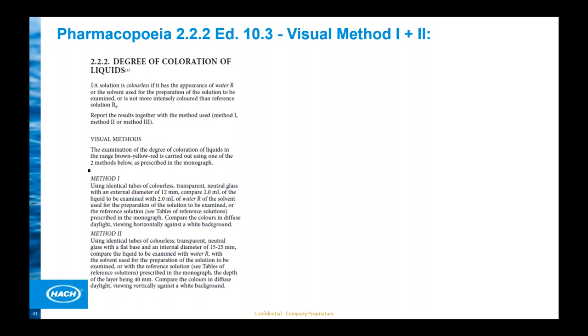It depends a little bit on which color, because the human eye can distinguish between millions of colors, and if they are side by side, delta E, sometimes you can see a simple delta E of, we have to distinguish between surface colors and liquid colors. I think liquid color, you don't see a delta E of 0.1 or so by your eyes. That's really difficult to see. But on surface color, you can really see a delta E of 0.1.